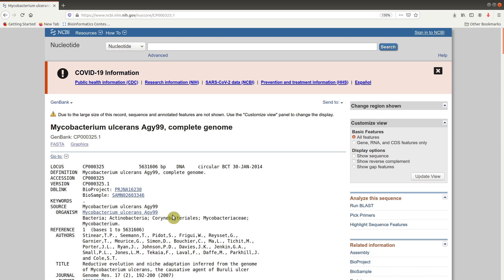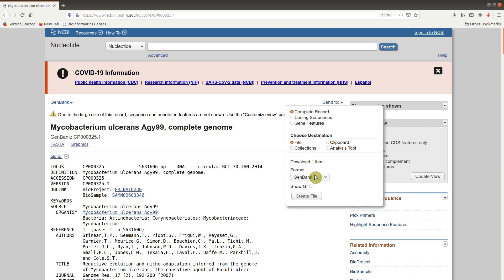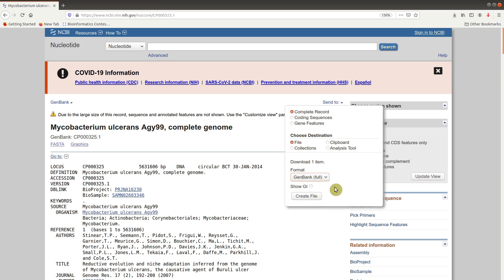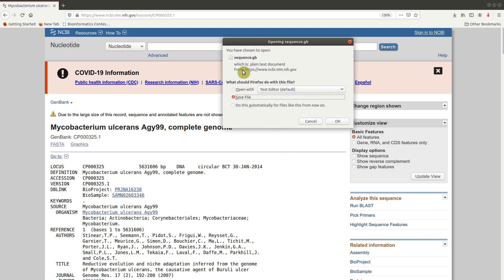To download the GenBank file, go to the 'Send to' section and click on it. Make sure 'Complete record' is checked, then choose destination and click on 'File'. When you come to the format, select GenBank — that's what we are going to use. After that, click 'Create file' to download it. You'll be asked to select the download location.